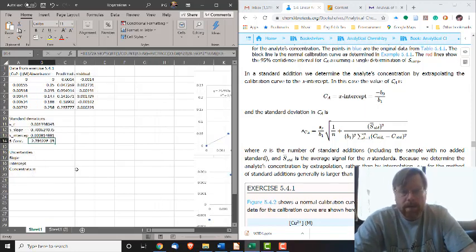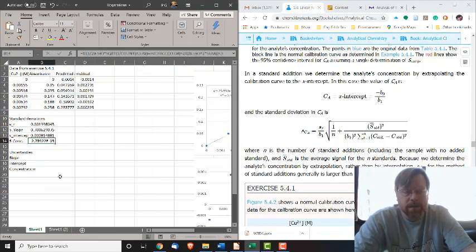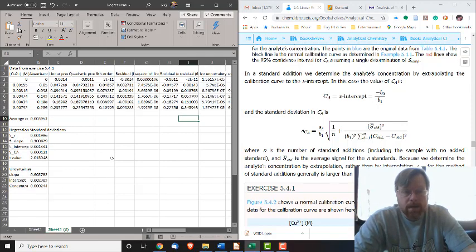On these, it pays very much to double and triple check your calculations, and a lot of times it is easier to add extra columns to keep track of things. I tried to shortcut that here in this sheet. I did not over here. So let's look over at this one instead.